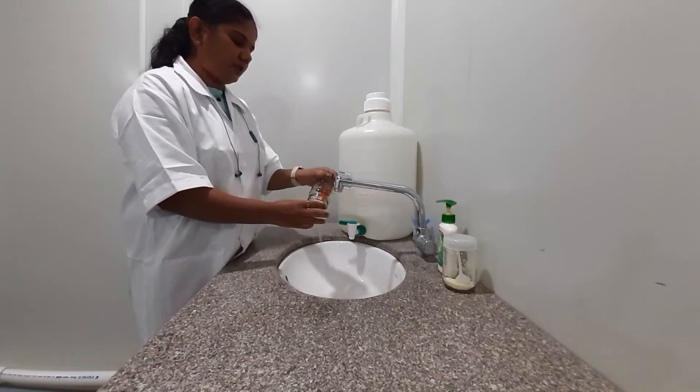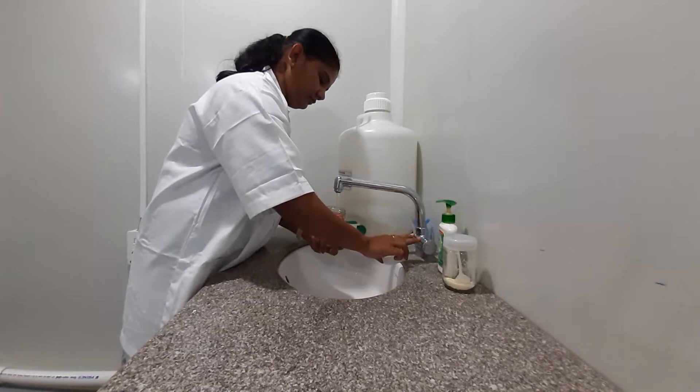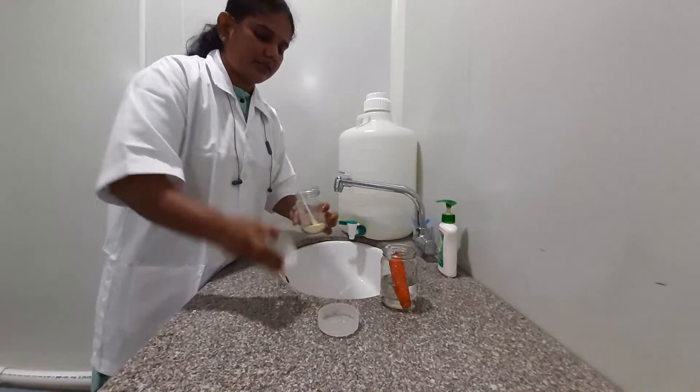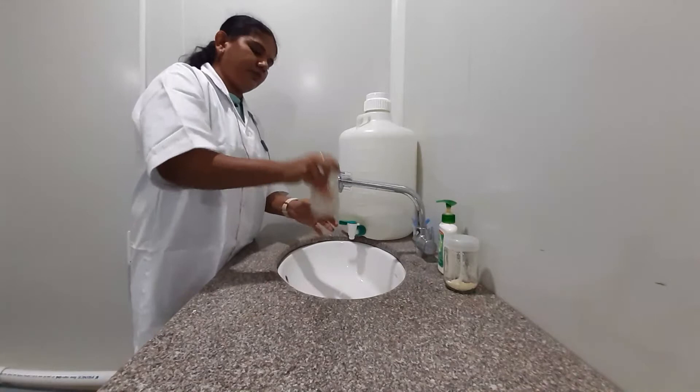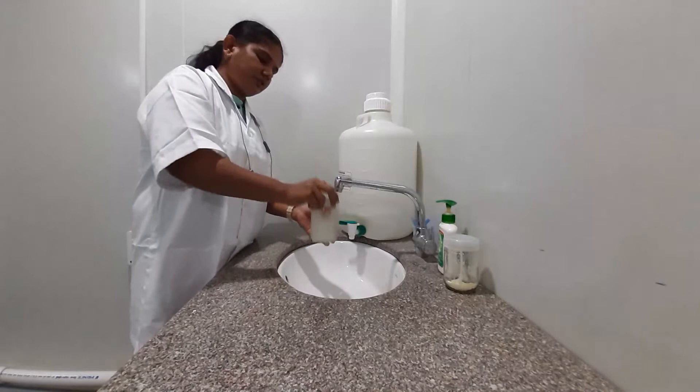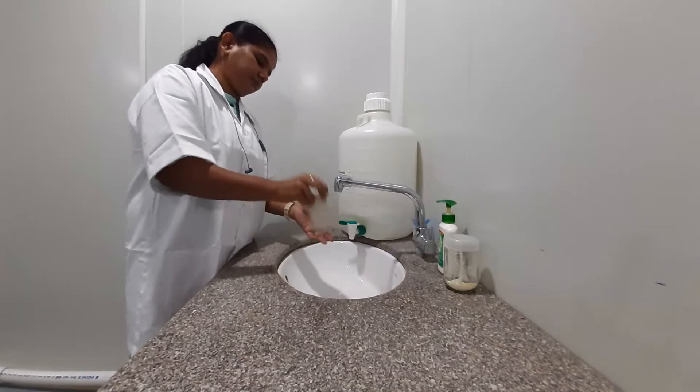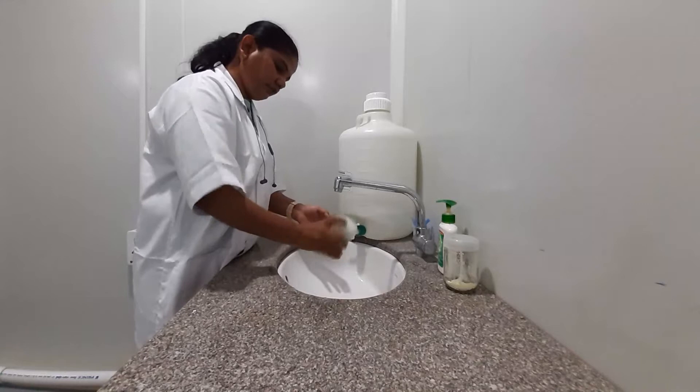Thorough rinsing will be done. Next, as the carrot is grown underground, its surface has more microorganisms. For that, we have to rinse it using detergent. We will wash the carrot with detergent solution for about 10 minutes.